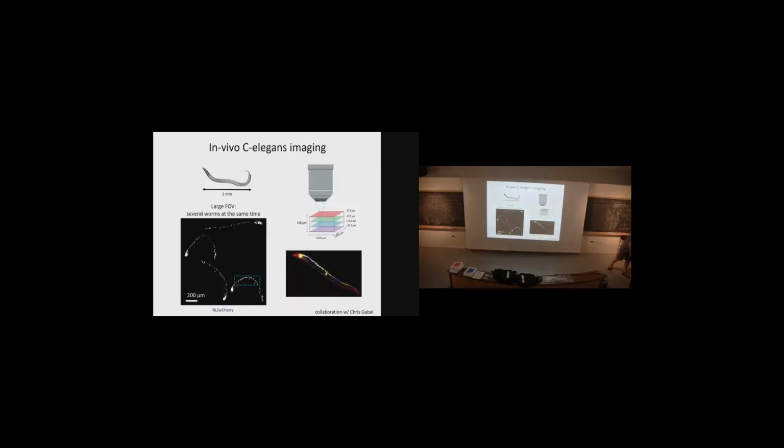Oh, and you can colorize it if you want. This is C. elegans, and you can see this 4-plane imaging. This was work by Emery Badon, by the way, who many of you know.